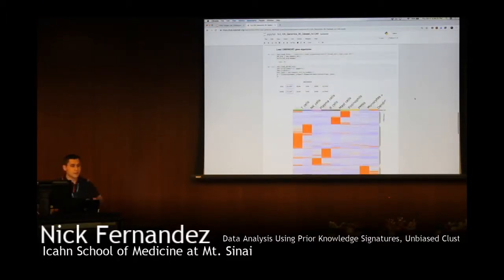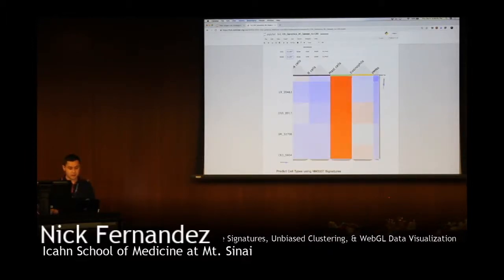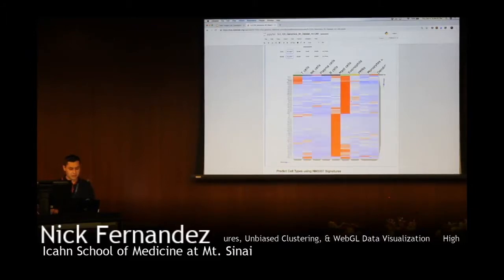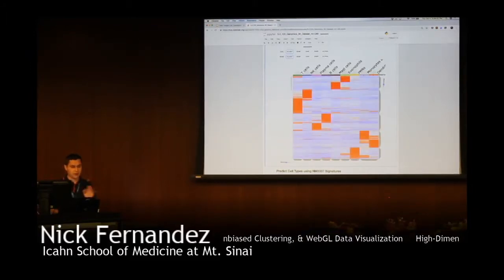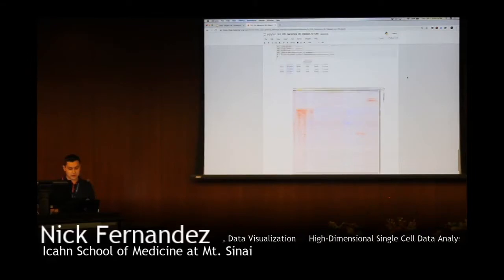So we just brought in the gene expression signatures from CIBERSORT, which is a public data set that was published previously. These are their gene expression signatures of different cell types. They have these broad cell types, and we're just taking these signatures and using them to label our cells. And this already ran in real time. So we took that same 1,000 cells and we labeled them.